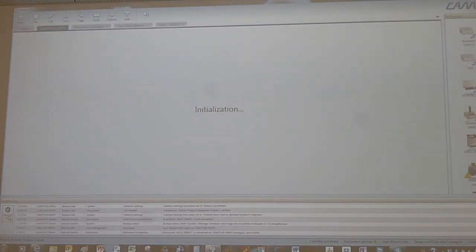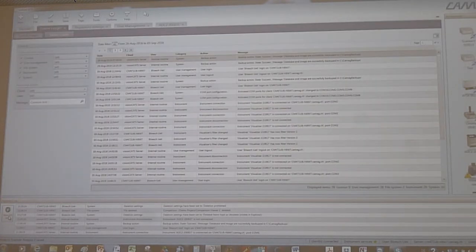And the other log file is the system log. Here it's also all in one software, so it's also good. In WinCat there were these two softwares. And if you remember, the system log was day by day, so you could just check one day, and then you had to archive it, and then you could check the entries of each day. So here now you see all the data.